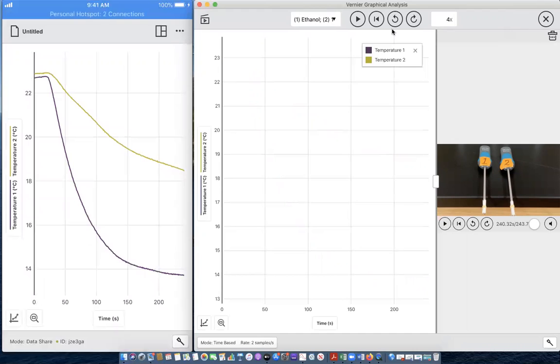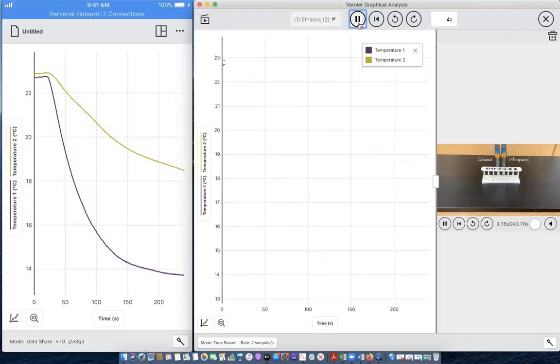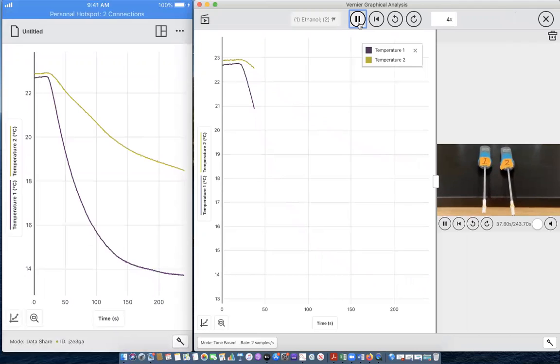So when I start this over again, that data has already been downloaded to the student computer, so they have that data. If you launch the student's device before you start collecting data, sometimes they'll see a live readout of those results as they progress across there.